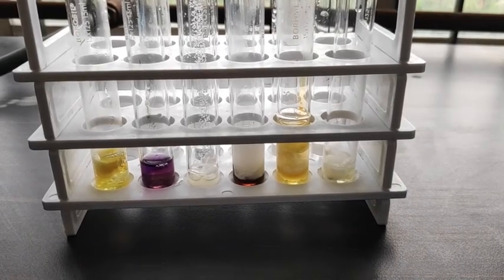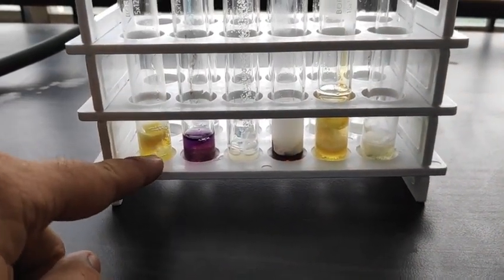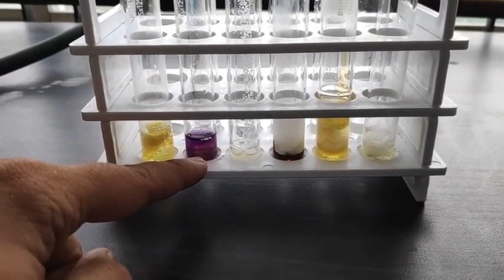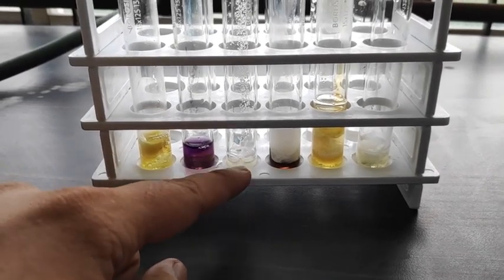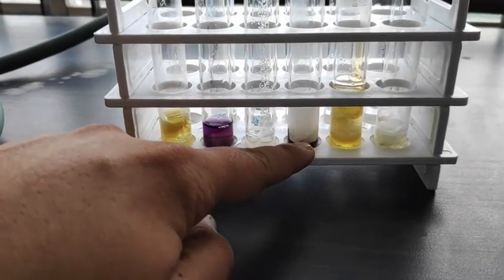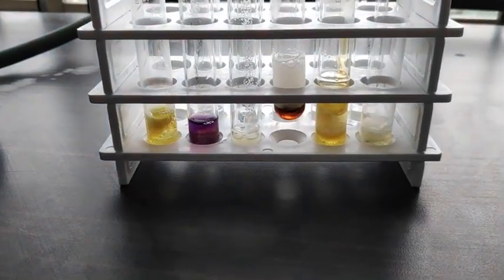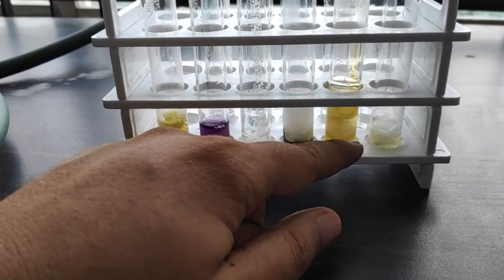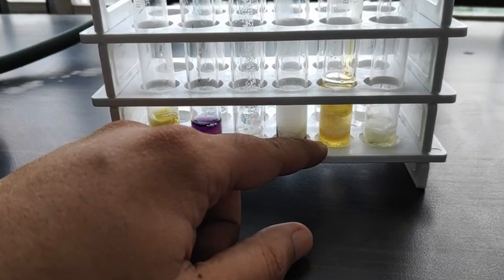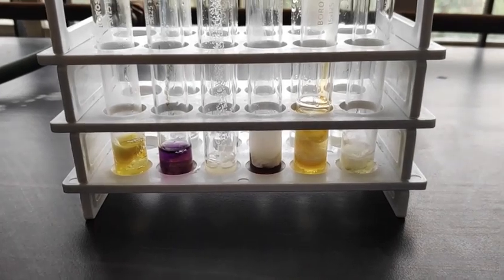Now we have all the tests which are present in front of us. The first one, which is already present on the left, is the Heller's test. The next one that we have performed is the biuret test. After the biuret test, there is the full saturation test that we have performed. The next one is the lead acetate test. See, we have the brown color, and how the brown color is now deepening with time. The next test is the xanthoproteic test, which tells us whether any kind of aromatic acid is present. And finally, what we have is the sulfosalicylic acid test.